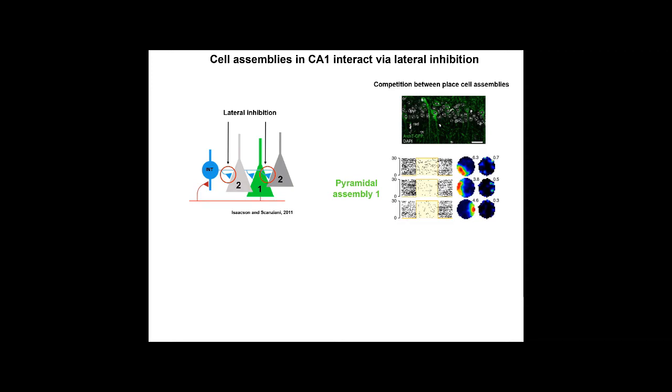So you see the two columns on the left where it says 6.3, 3.8, 4.6, those are the peak firing rates in the place field. On the right, the right column of 3 circles, that's when the light is on, and therefore obviously the place fields are gone. So this isn't surprising. You turn off cells, they stop spiking, right?